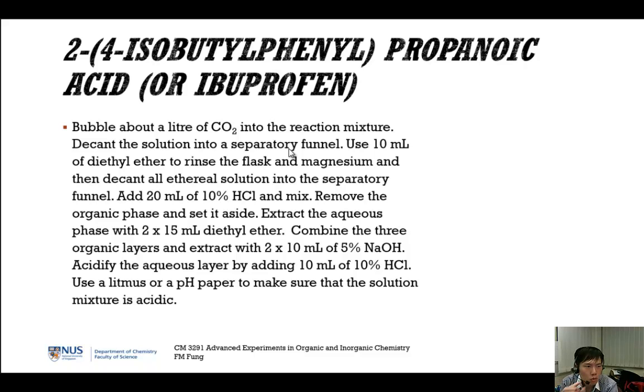Then after that, you remove the organic phase and let it stand. Extract this aqueous phase. You watch it carefully. This part is quite confusing because you have many extractions here. You have to do the right thing. If not, you just throw away your compounds. Always play safe if you're not sure or you're just paranoid.